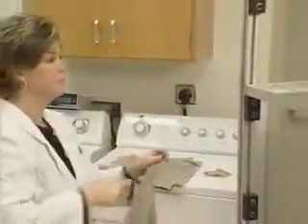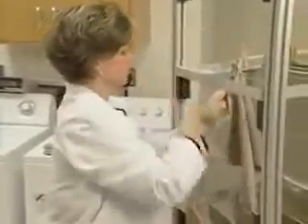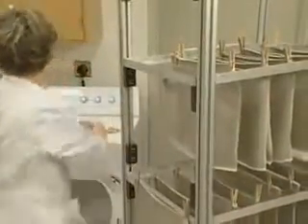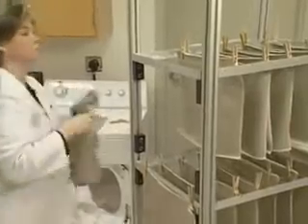Remove woven specimens from the dryer after the final drying cycle and hang on the clotheslines of a portable cart. The length direction of each specimen should be hung vertically.